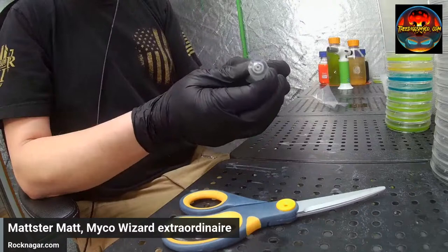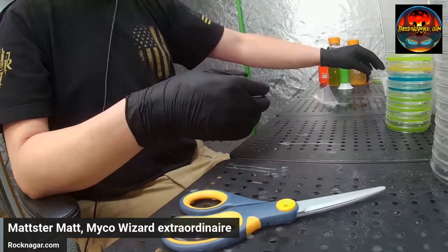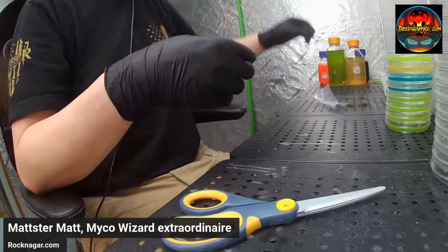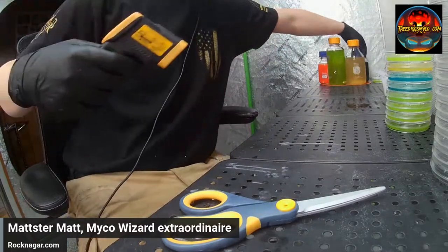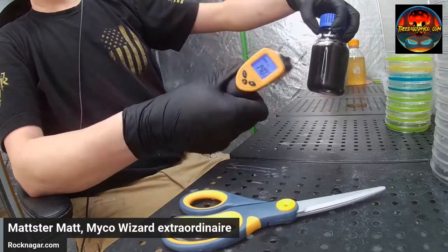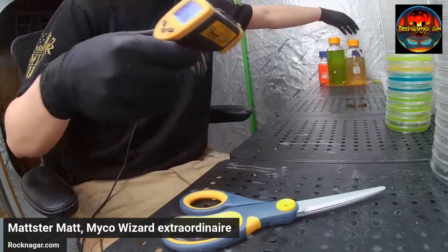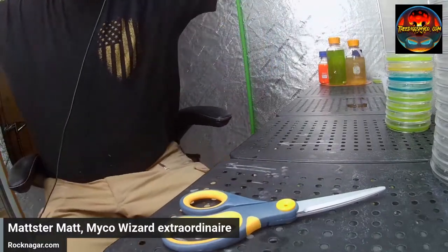We also have our handy dandy syringe here that we'll be using. In fact, I should go find some needle tips. I think we probably still got a few minutes before we're ready, but why don't we take a look and see? Yeah, we're at 1:40, so we still got a couple minutes. So I'm going to go ahead and grab that, as well as set up my mixer. So I'll be back in 1 minute.